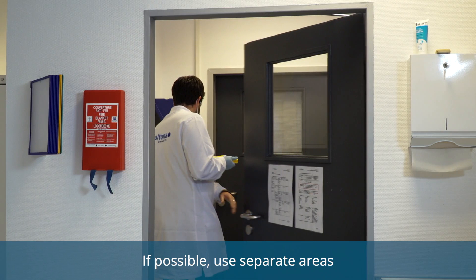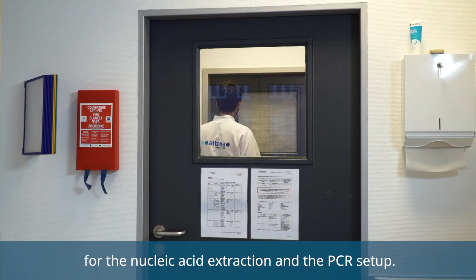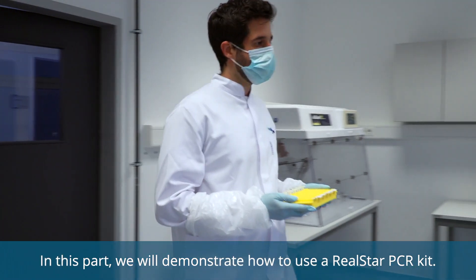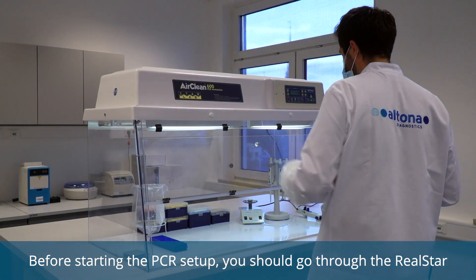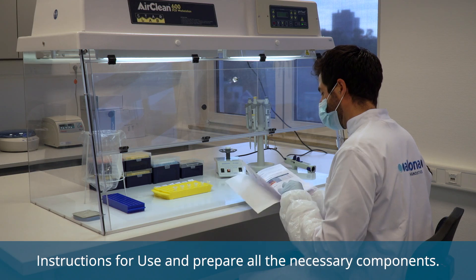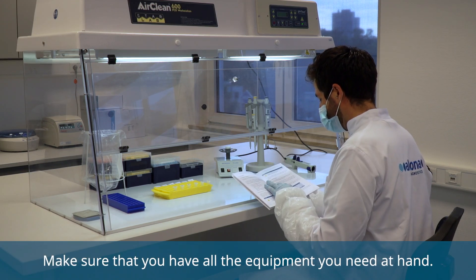If possible, use separate areas for the nucleic acid extraction and the PCR setup. In this part, we will demonstrate how to use a RealSTAR PCR kit. Before starting the PCR setup, you should go through the RealSTAR instructions for use and prepare all the necessary components. Make sure that you have all the equipment you need at hand.